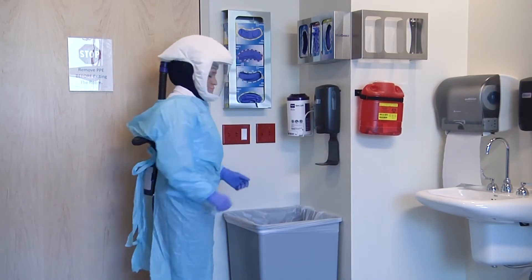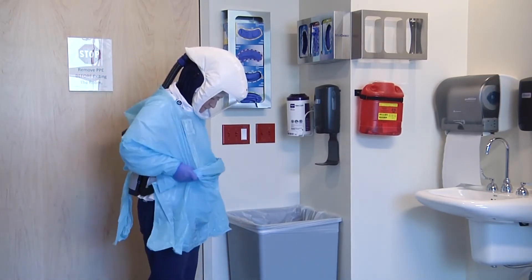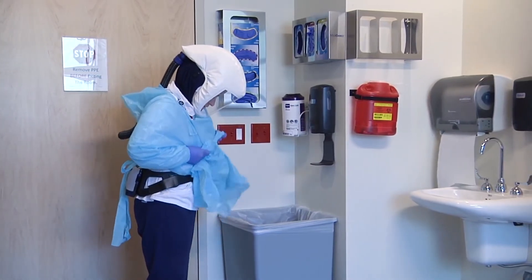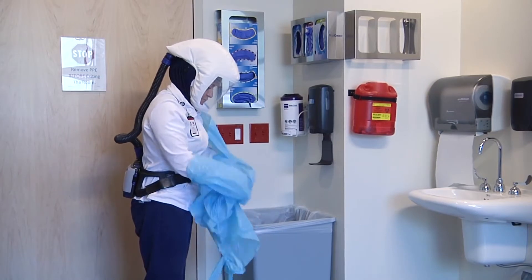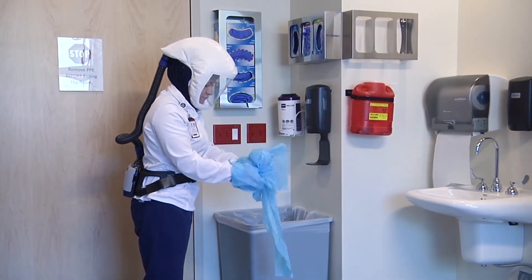To doff the gown and gloves: first, grasp the gown at both sides of the hips. Bunch the gown. Slowly pull away from the body until ties tear. Pull down and away to break the neck of the gown. Roll and gather the gown away from your body, removing the gloves in the process.